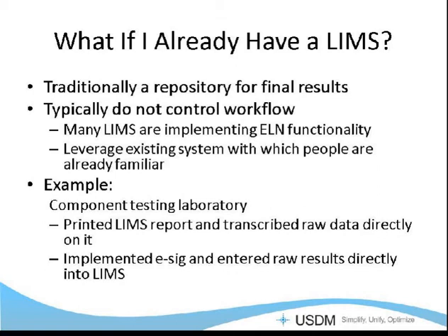These days, I think a lot of LIMS vendors are seeing the value in having the electronic laboratory notebook. So they are adding functionality in there. Every time a new version comes out, there's some extra bit in there that kind of pushes into the ELN functionality. I would absolutely suggest if you have a LIMS system that you would leverage whatever opportunities there are in that one.